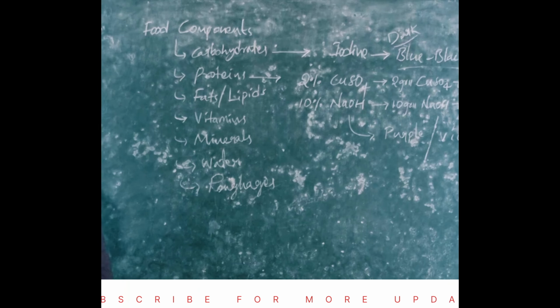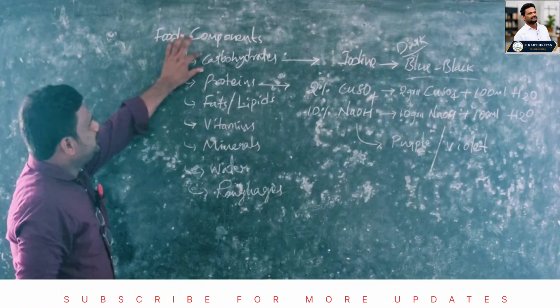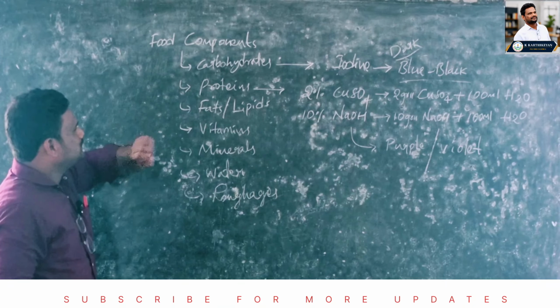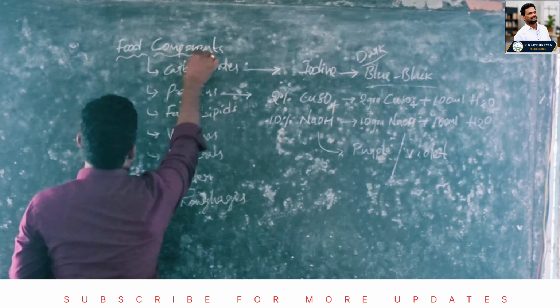Today we'll explain about food components and their experiments to confirm whether carbohydrates are there or not, proteins are there or not, fats are there or not. Okay, let us see. First, you know all about food components.